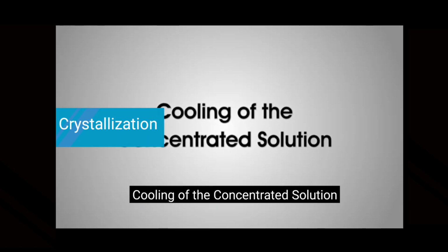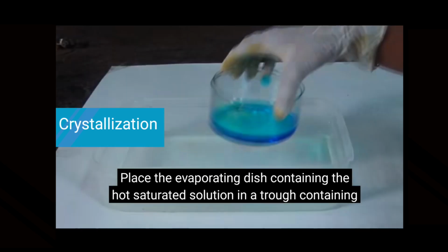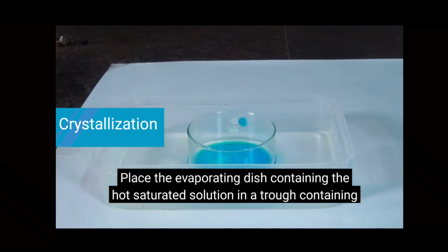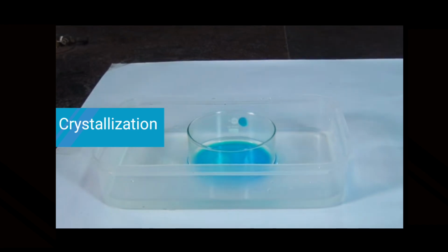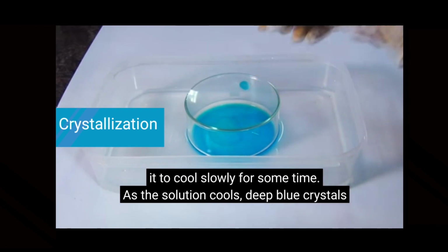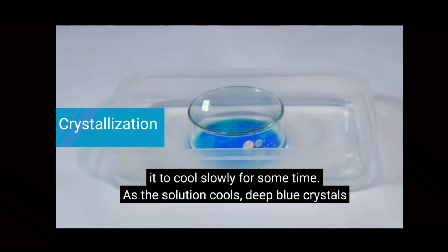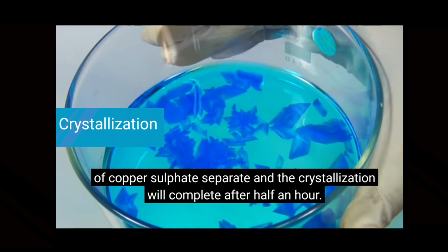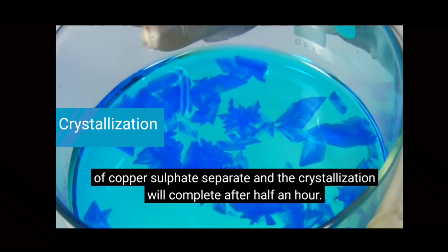Cooling of the concentrated solution. Place the evaporating dish containing the hot saturated solution in a trough containing water. Cover the dish with the watch glass and allow it to cool slowly for some time. As the solution cools, deep blue crystals of copper sulphate separate and the crystallization will complete after half an hour.